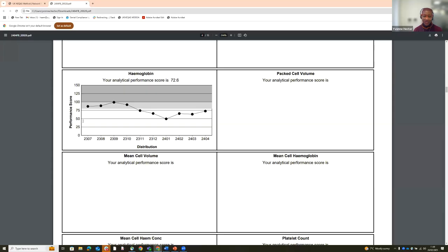So as I said, 50 is fine. I would expect scores to fluctuate around here. But once it's below the grey area, I'm not so concerned. When it starts hitting into the 80s and above, then that's when I start to get concerned and want to do some internal investigations.